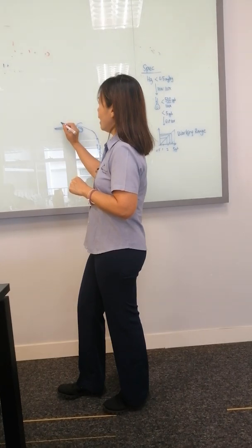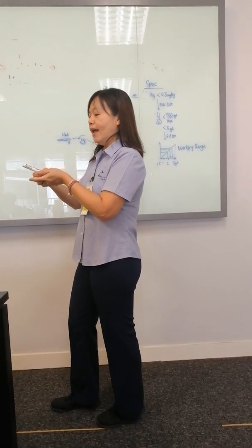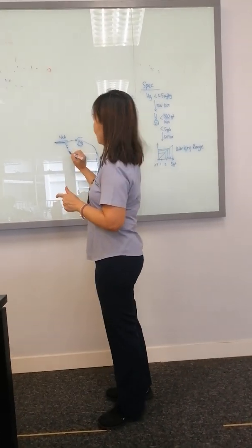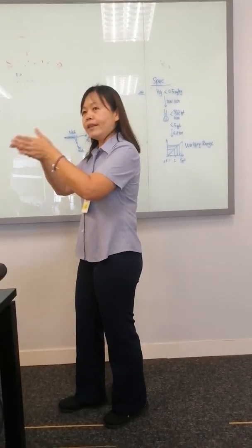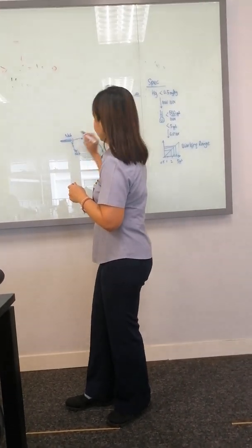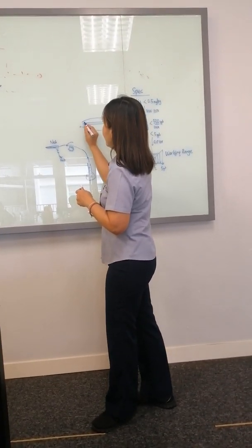So this is a nebulizer. The concept of the nebulizer is like that. The sample goes into the capillary, and then your argon gas is blowing in this way. This argon gas, we call it nebulizer gas, because when you use argon gas as a nebulizer, we call it a nebulizer gas. The nebulizer gas will blow at the outside. So what happened is, at the tip, if I want to zoom it out and draw a bigger image, it will be like this. Argon gas is blowing this way, blowing this way.